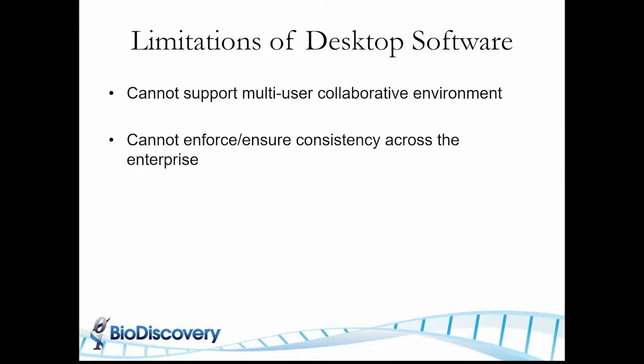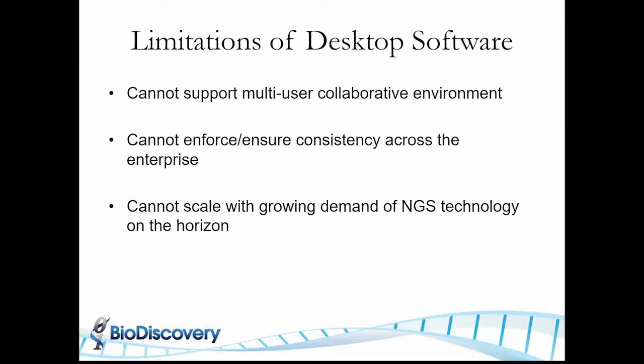An even bigger issue is it's very hard to enforce because these are individual programs. It's very hard to ensure consistency across the enterprise as far as how samples are processed and how they're reviewed. That is a very big limitation of the software.